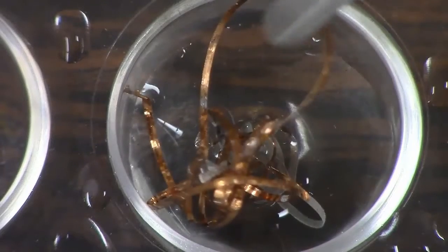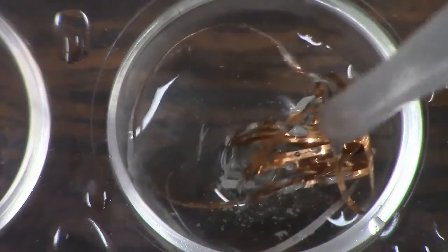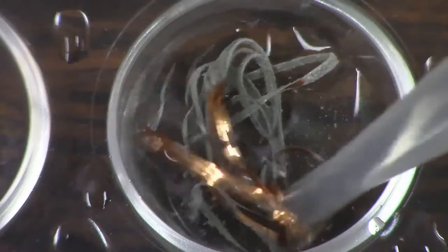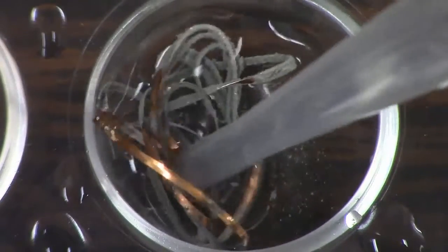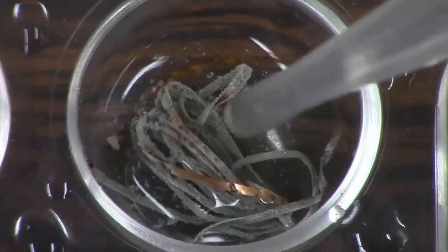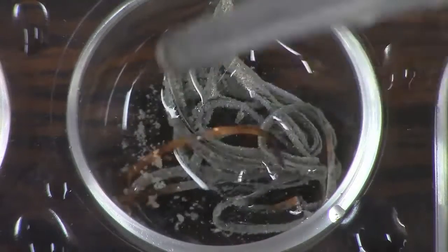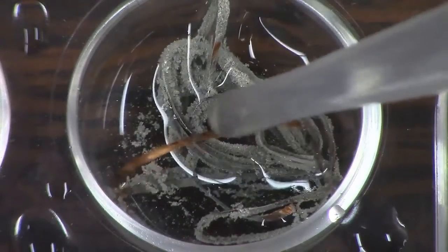So observe what happens to that copper wire as it is being mixed with the silver nitrate solution. And then based on these observations, I'm not going to give it away, but I think you should really be able to predict what products are being formed. Think about what might be now coating that copper wire.